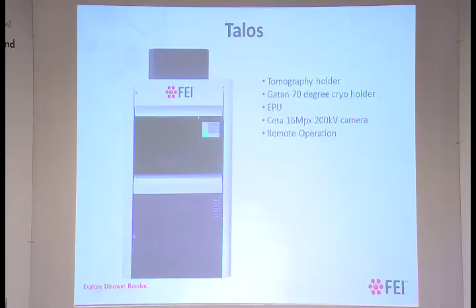And you can operate it remotely, so you don't need to be in the same room. So with the microscopes of a few years ago, you would need to actually be in a room which would usually be dark for several days taking pictures. Now you don't need to. You can set up the machine remotely from your office once you've put your sample in, and then you can operate things from your office. You don't need to be at the microscope.